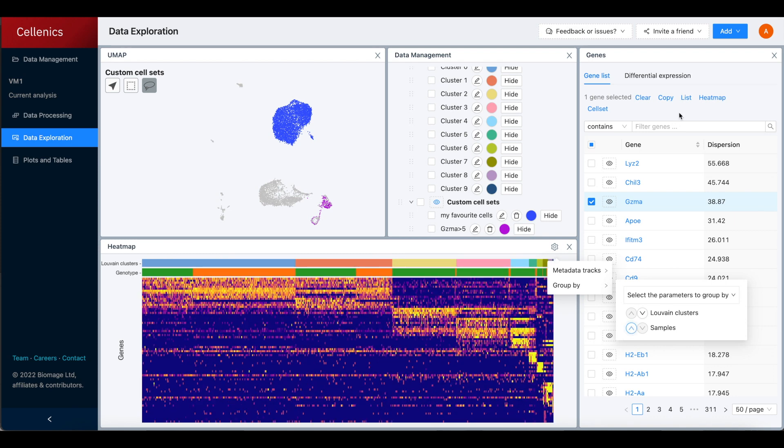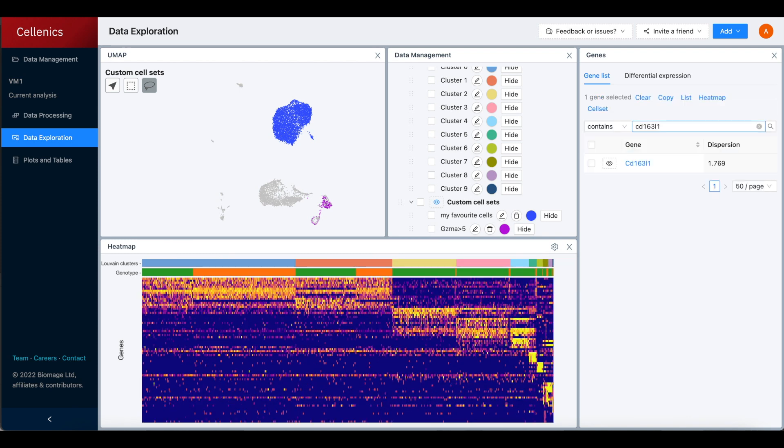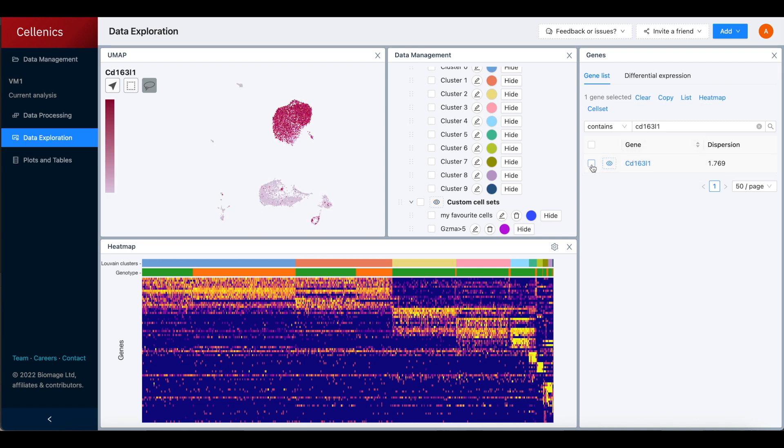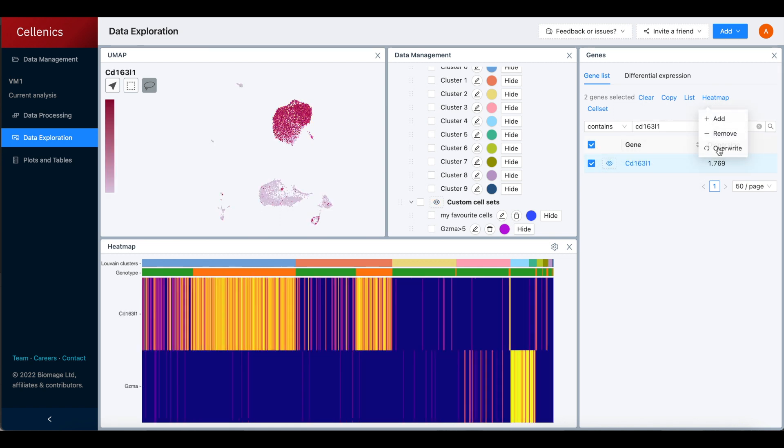You can search for specific genes of interest in the gene list and these genes can then be viewed on the heat map by selecting them and then clicking heat map and either add or overwrite.